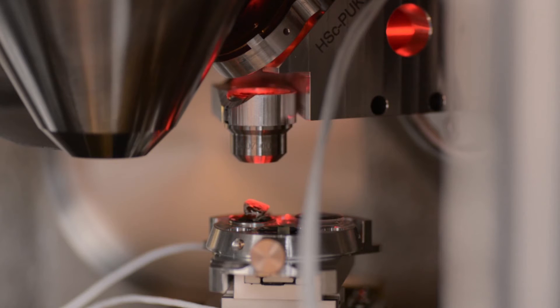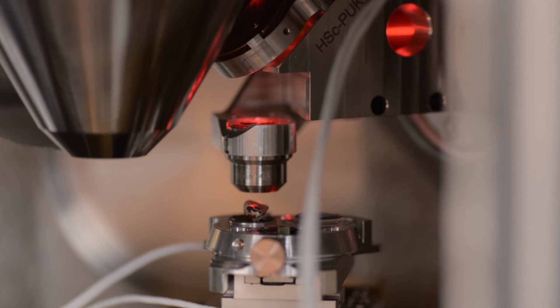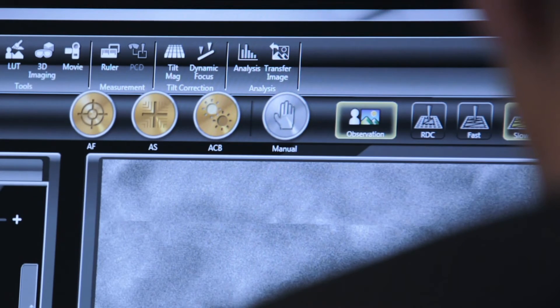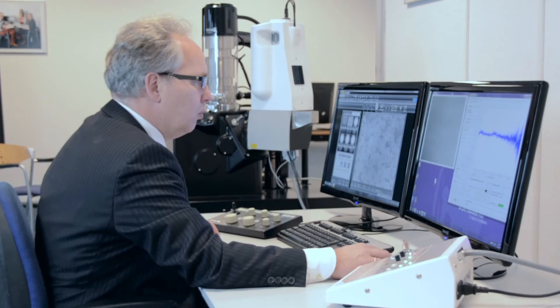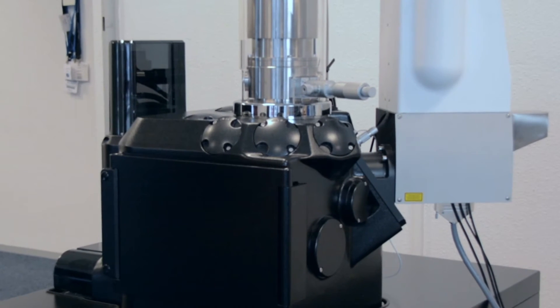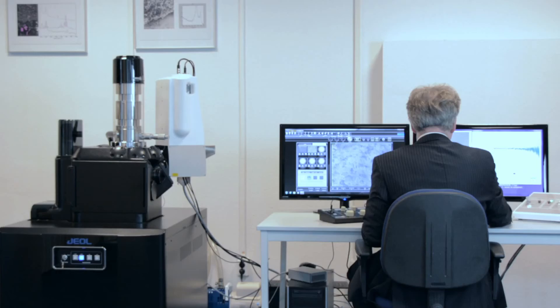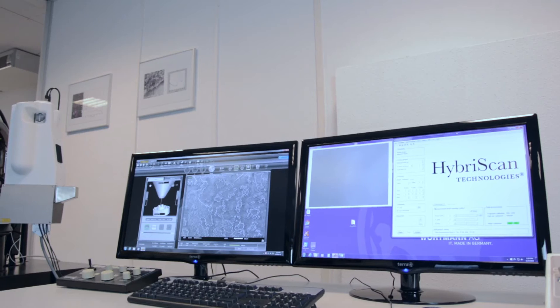The Raman effect is a non-contact, non-destructive spectroscopic method that enables the use of light to identify and characterize materials. The Hybrid Scan Raman system integrates seamlessly with the vacuum chamber of your electron microscope. The Raman system consists of an optical video microscope with an extremely sensitive Raman spectrometer.